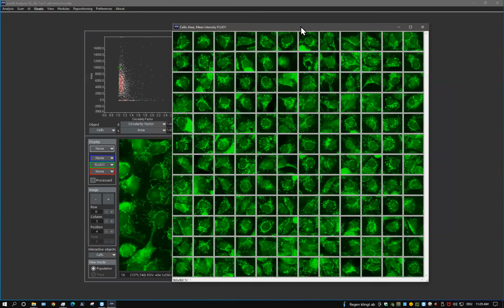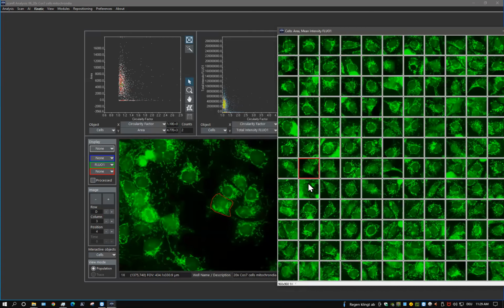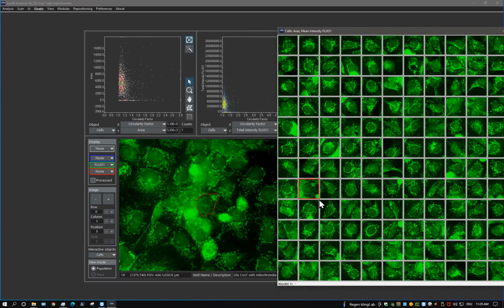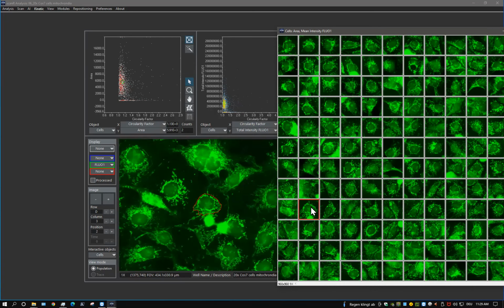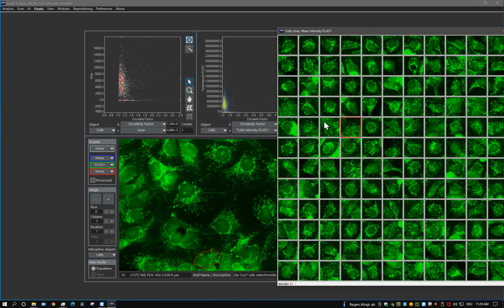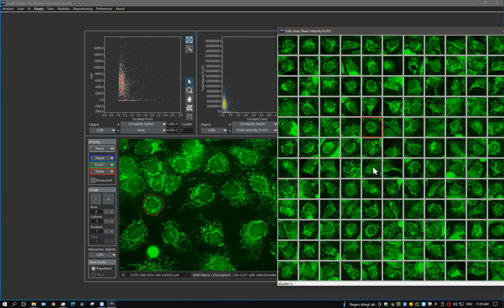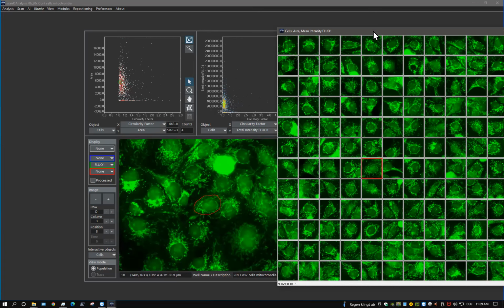And it's always reproducible. It will do the same in the next sample. It will have no bias like a human labeling person might have, who may apply different rules from sample to sample. Here, this is quite reproducible. And this is really a very good cell segmentation given the challenging situation here.